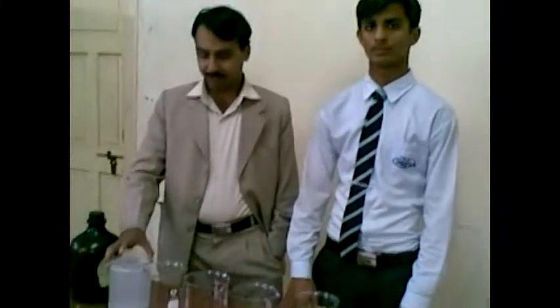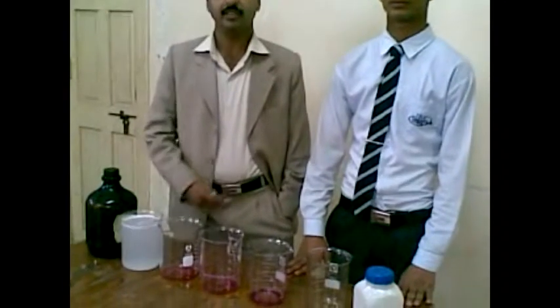This is a practical demonstration of the changing of the color of water. Mr. Rahmatullah performed this practical. He first took water — the scientific name of water is dihydrogen monoxide, and its chemical formula is H2O. As you know, water is a colorless liquid and the most important liquid.